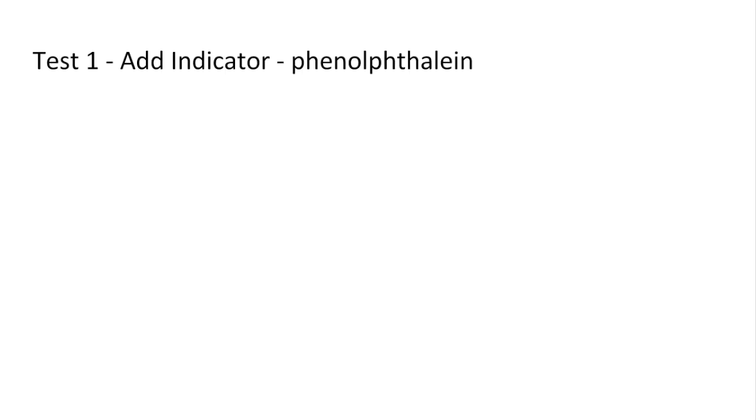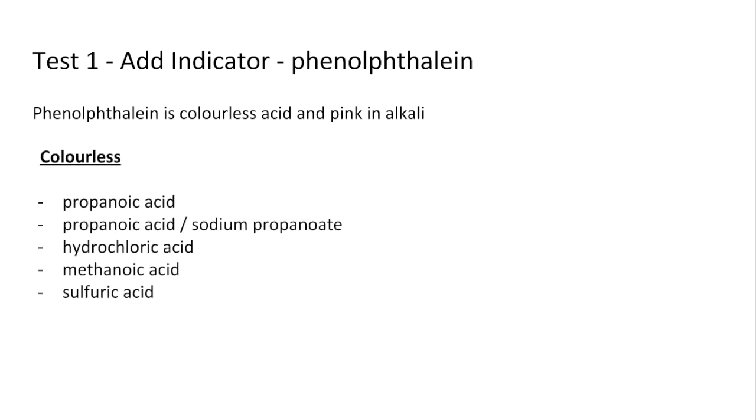The first thing I've decided to do is to add some indicator to the solutions and I'm going to use phenolphthalein. You can use different indicators like litmus, universal, or methyl orange but I've gone for this one. Phenolphthalein is colorless in acid and pink in alkali, so all the acid substances will go colorless and the alkaline substances go pink in phenolphthalein.